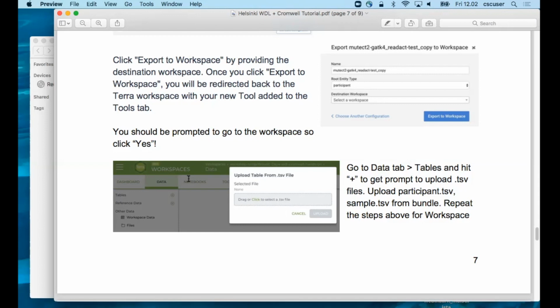We've run into an issue. Several people are trying to upload the TSV, but it's telling them the file doesn't start with the entity thing. When they're trying to upload the TSV file, they get an error that it's not valid because it doesn't start with the entity thing. Can I take a look here? Maybe I can click on it. That's fine. Who is getting that error?